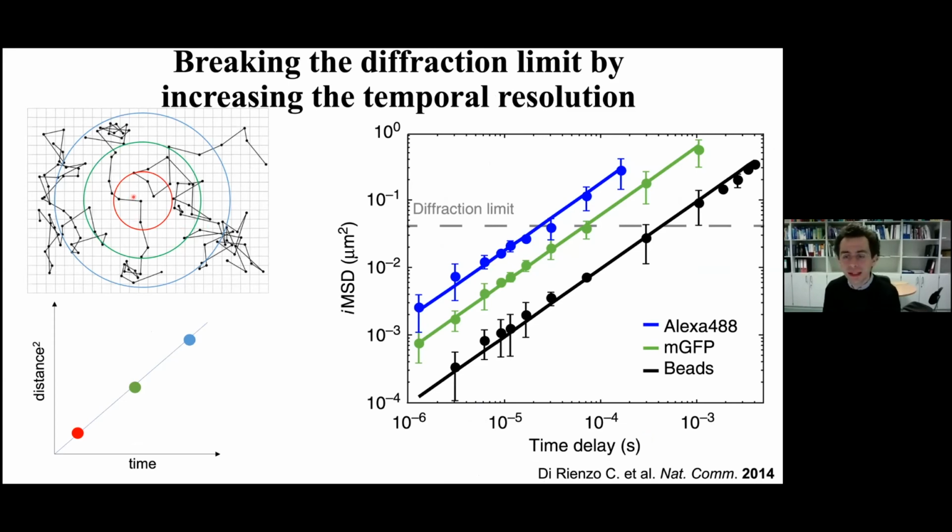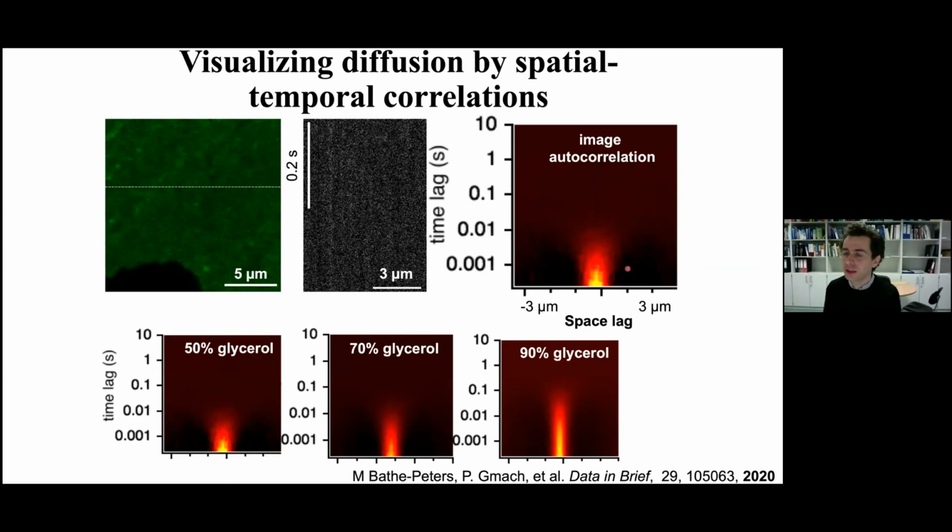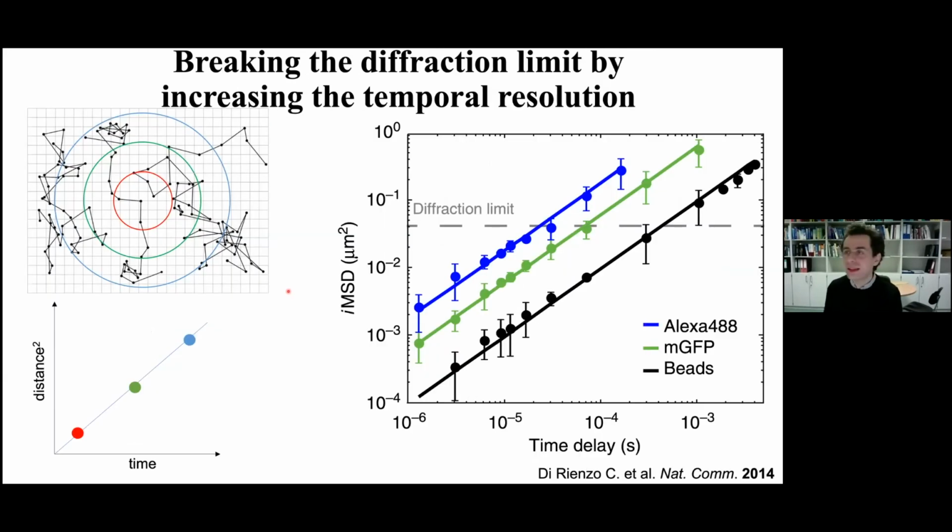If you look at the rate of broadening of this object, what you are basically doing is exploring how rapidly molecules explore their surroundings. And this can be quantified by an analysis which maybe many of you have already seen. It's called the mean square displacement. So you explore the area that a diffusing molecule covers as a function of time. And as time increases, the area explored increases. But if you look at shorter and shorter times, you are also looking at smaller and smaller distances.